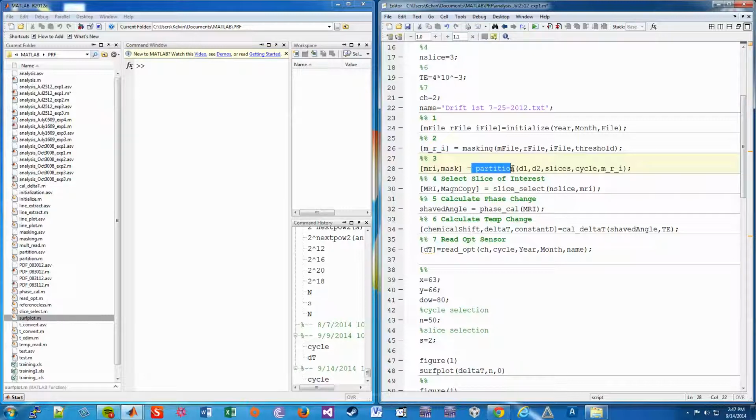This is when you manipulate this one-dimensional binary data into 4 dimensions, if you will. Just imagine a large string, and then you fold it so that you have 4 dimensions. I'm not sure if that's a good analogy, but basically it's a very long line of numbers, and you want to fold it into an image, because each number represents a value in the image. The original raw data is not an image file, it's just a long string of numbers, and you want to partition it, fold it in such a way that it can be plotted as an image.